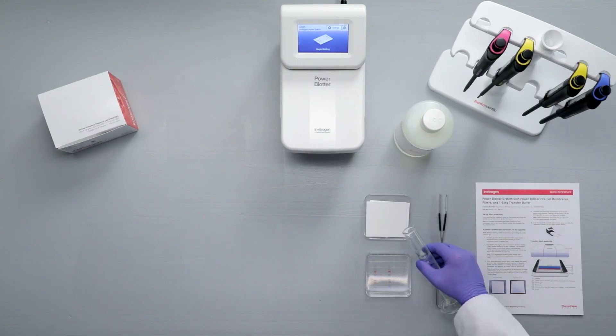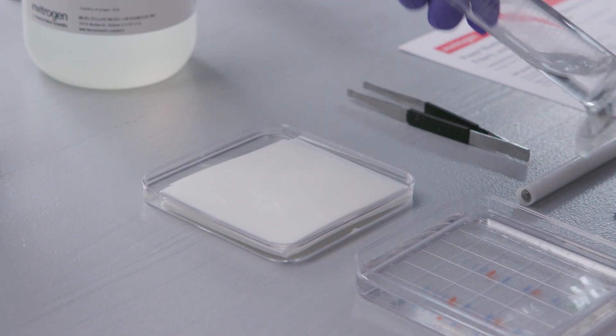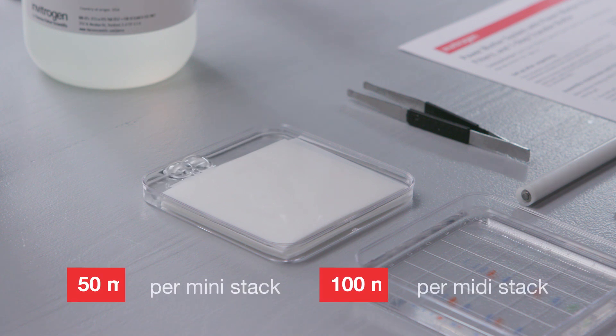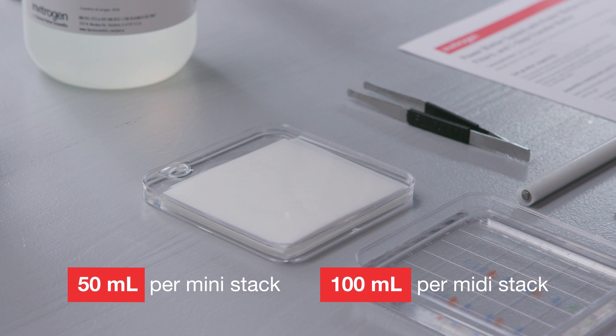Equilibrate membrane and filter papers in the diluted Power Blotter One-Step Transfer Buffer for a minimum of five minutes. Use enough buffer to completely cover the filter papers and membrane. Four pieces of filter paper are required for each membrane. When using a PVDF membrane, be sure to wet the membrane with methanol or ethanol before soaking in 1x Power Blotter One-Step Transfer Buffer.